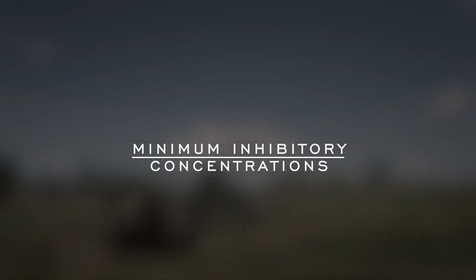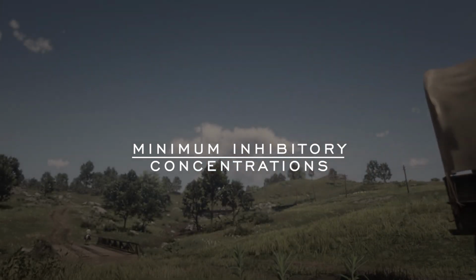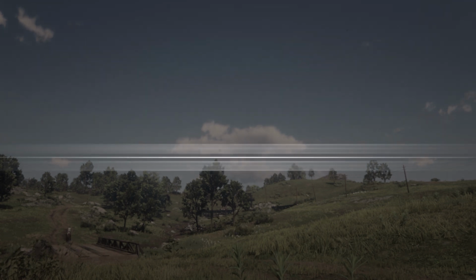Today we're going to perform minimum inhibitory concentration testing. MICs are very important and will tell us the susceptibility of an isolate to an antibiotic. The MIC is the lowest concentration of an antibiotic required to inhibit growth. There are a few methods available, and today we are going to be using the microbroth dilution method in a 96-well plate.